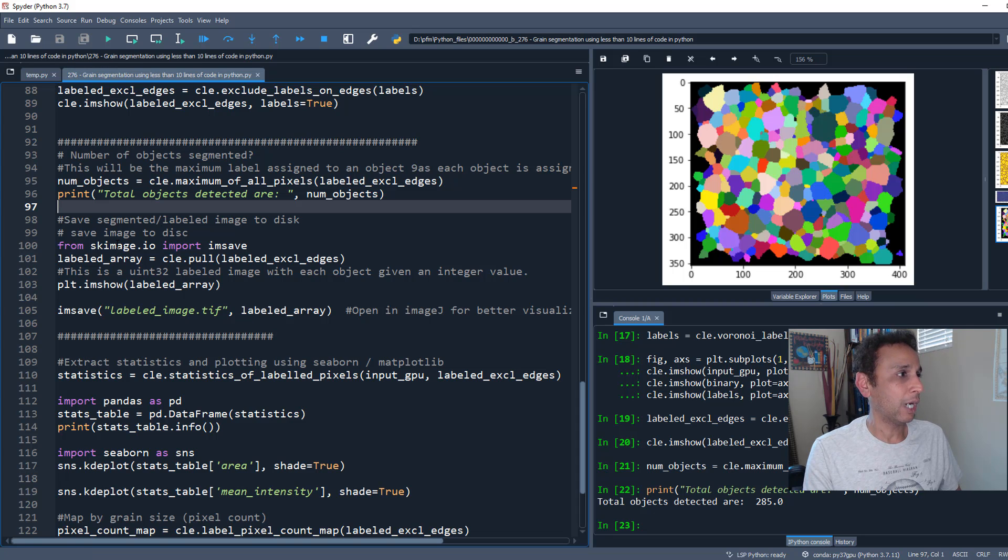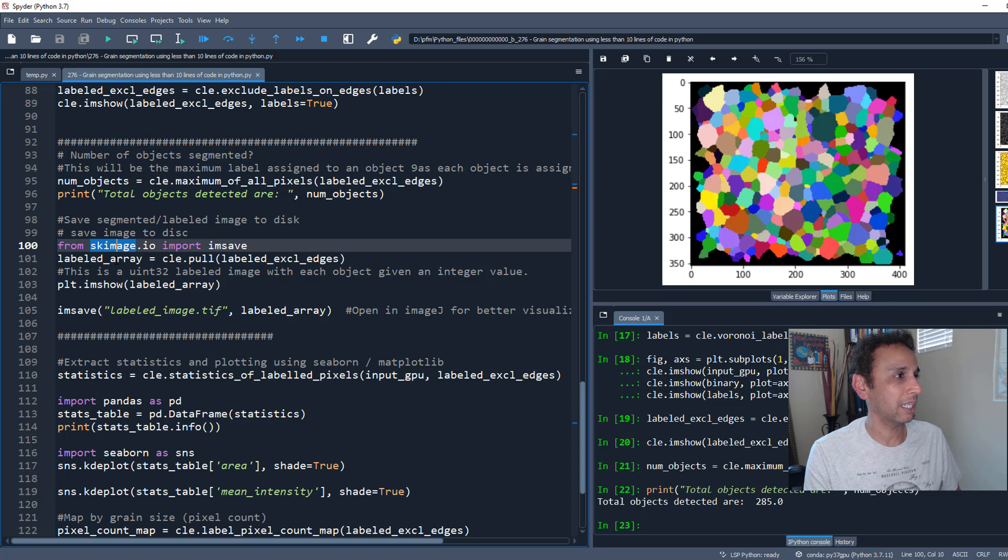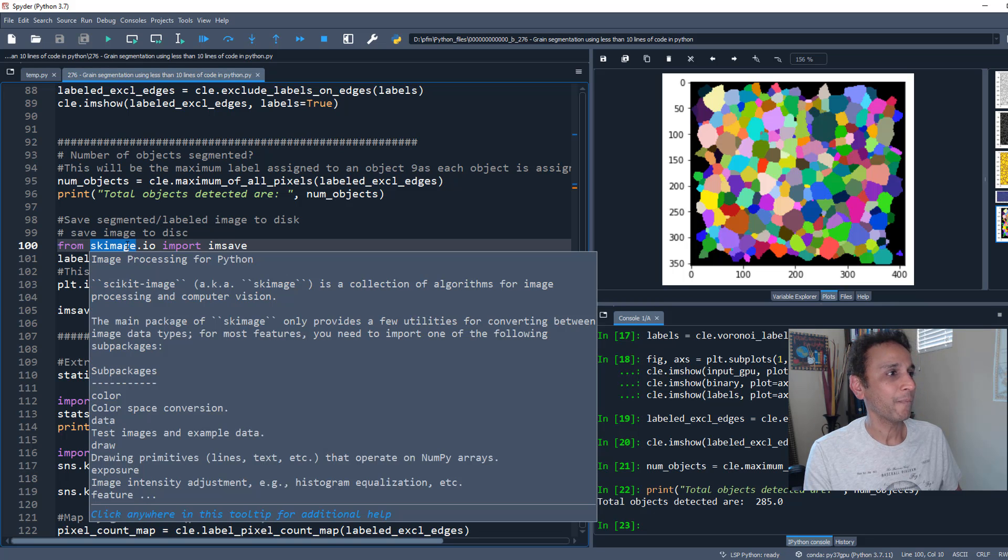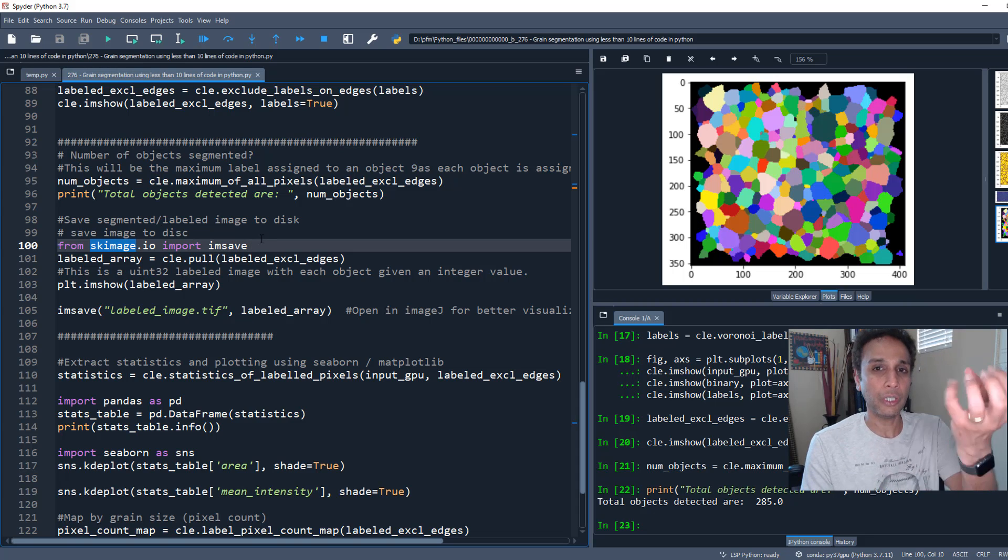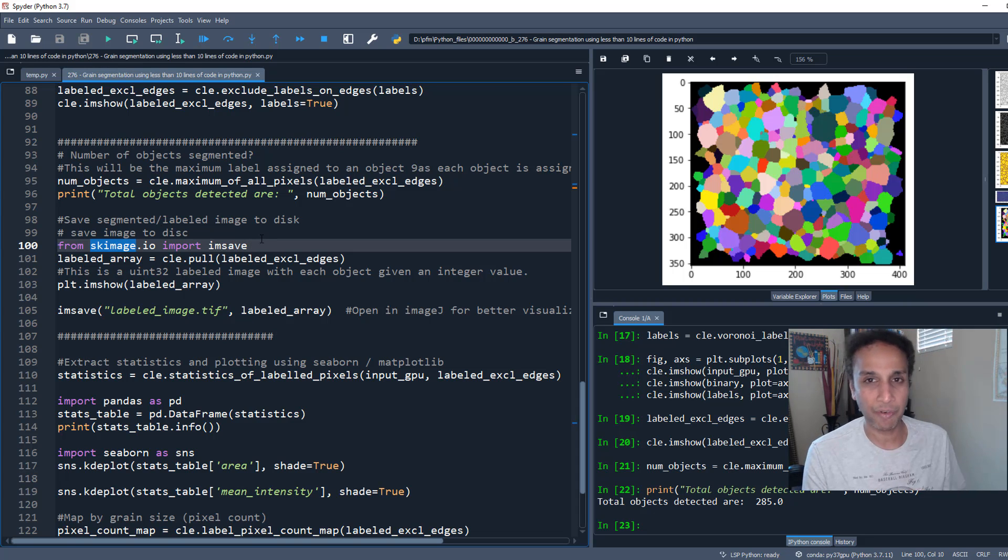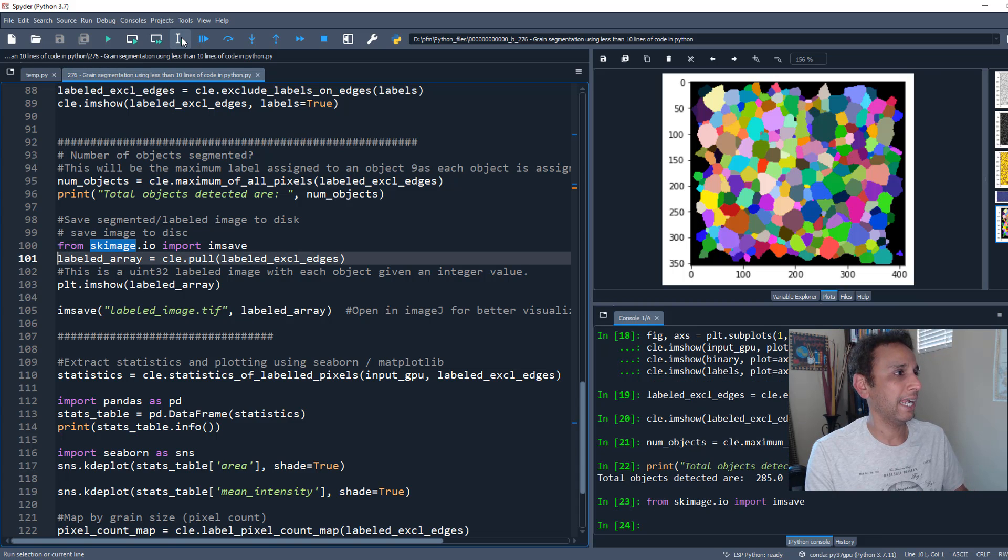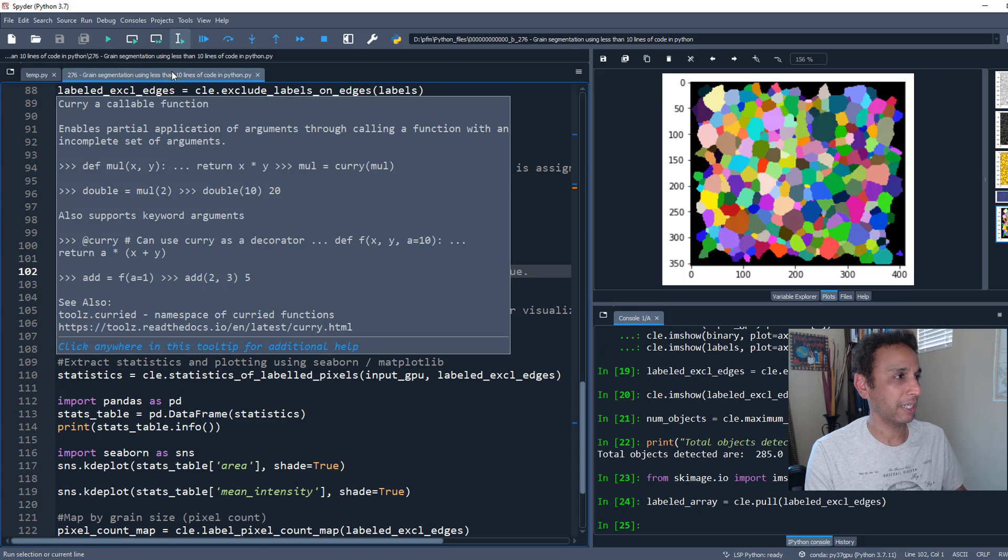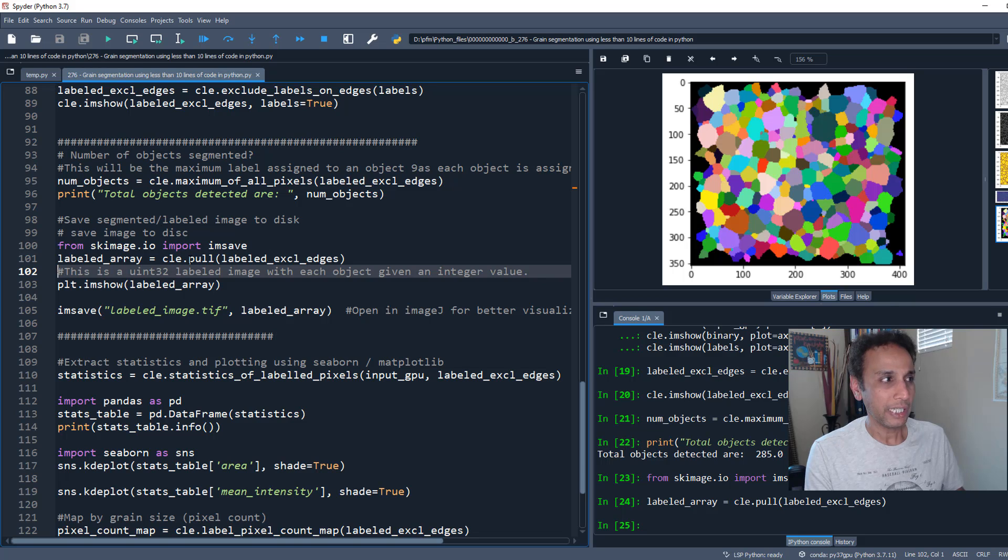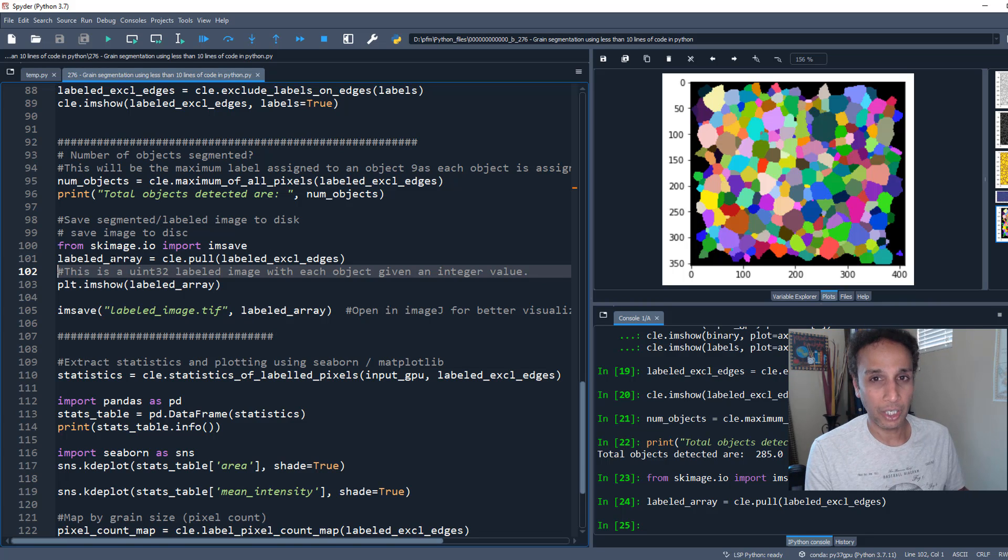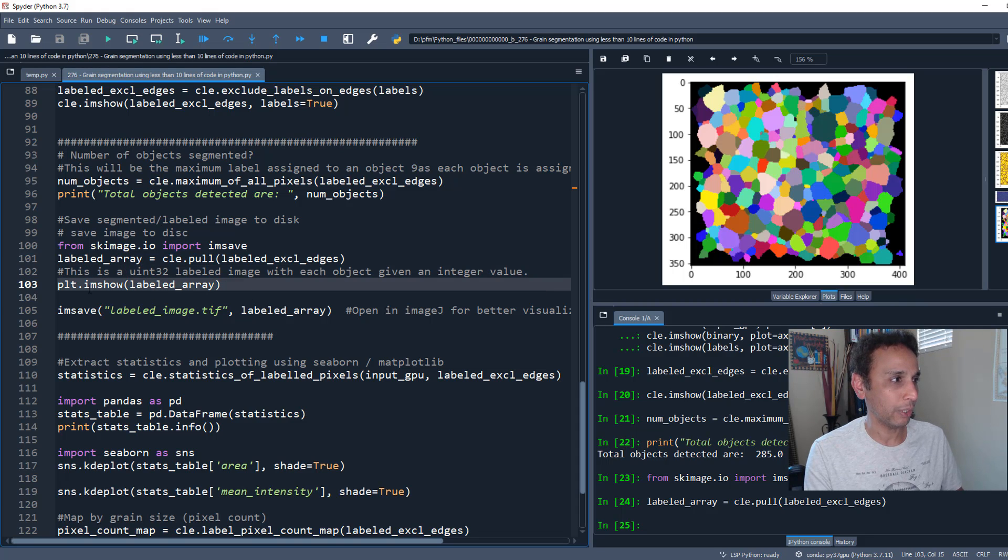If you want to save this to disk, you need to pull it. We pushed it into ClassPeranto, now we're pulling it. When you pull it, it's a numpy array. Now I can do whatever with that array.